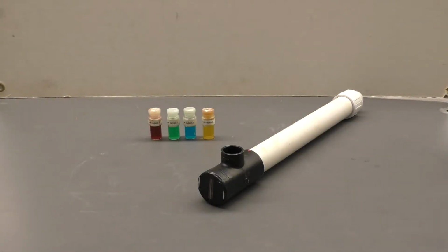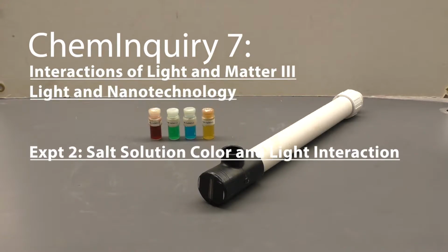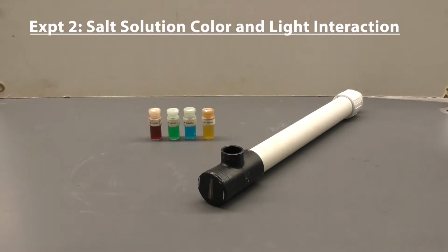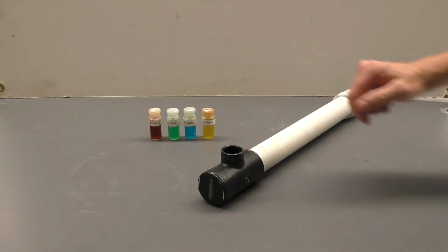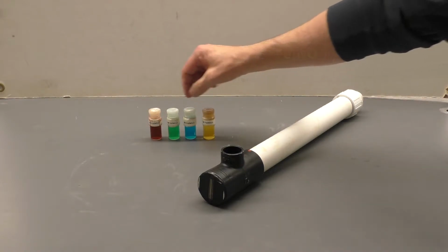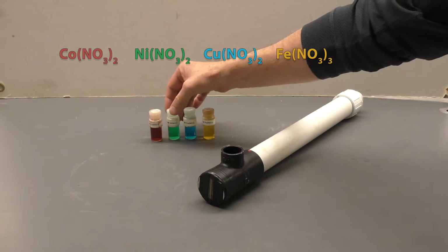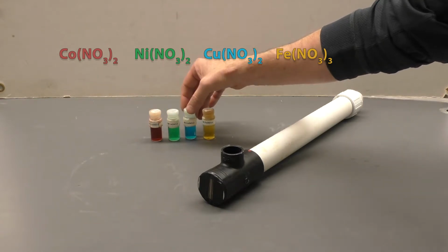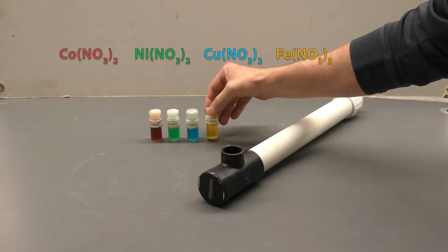This is experiment 2, part 1 procedure, color absorbance, a qualitative investigation for Chem Inquiry number 7. What we're interested in here is qualitatively looking at what happens when light passes through something that is colored. In this case, we have 4 different transition metal ion solutions. The pinkish red one is cobalt nitrate, the green one is nickel nitrate, the blue one is copper nitrate, and the yellow one is iron nitrate.